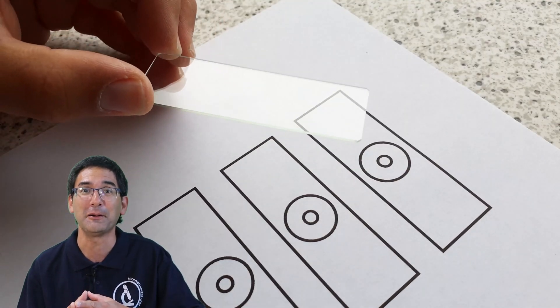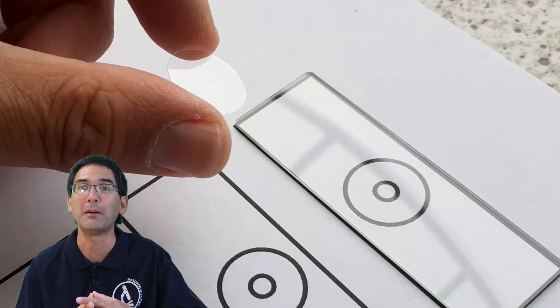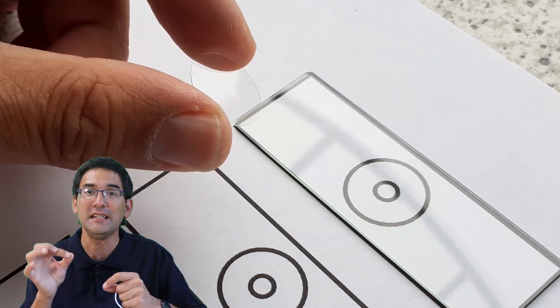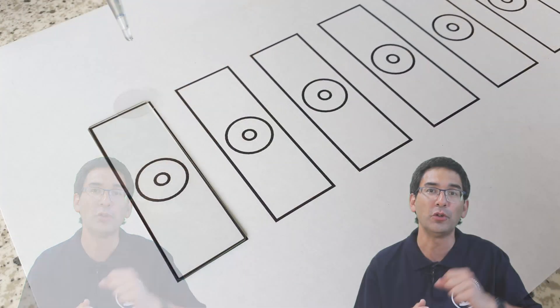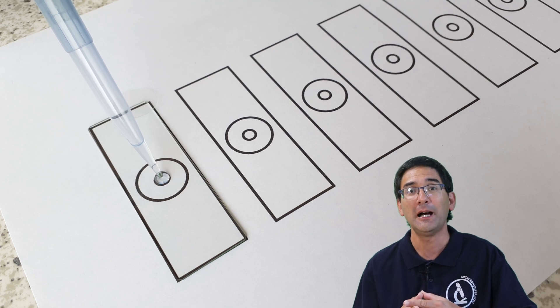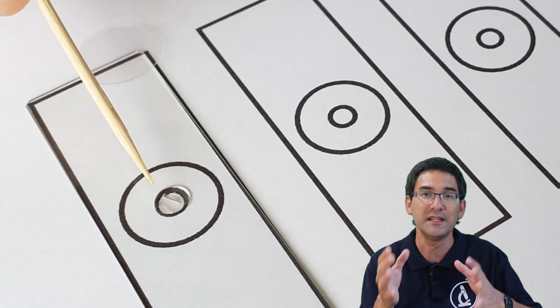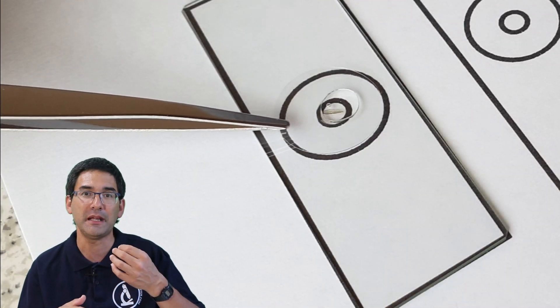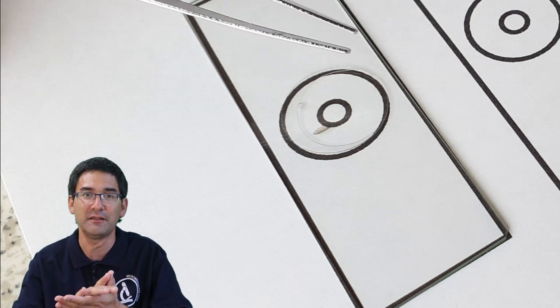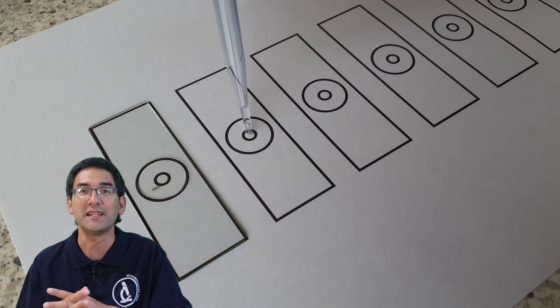Here I prepare the permanent mount. I printed out templates made in PowerPoint — this allows me to place the insect right in the center of the slide. I'm also using a round cover glass. First I put a small drop of mounting medium on the microscope slide, then using a toothpick I transferred a part of the insect — in this case the wing — into the mounting medium, oriented it a little, and then put a cover glass on top. The mounting medium compressed and everything was nice and flat. I kept doing this for the next couple of slides.